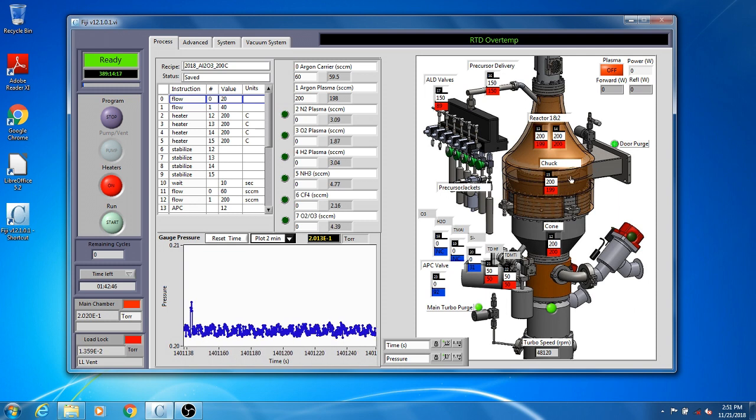We will now show the computer screen for setting the heaters. This is the precursor delivery and the ALD valve temperature, which needs to be set at 150 C. Users are not allowed to change it. The precursor temperature can be changed where the cursor is moving around.